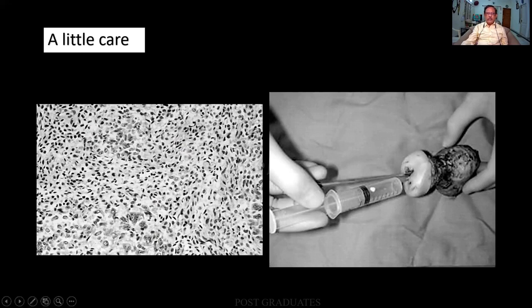And look at the effect of the non-fixation. I find that the cells are all going apart and the stroma is giving way. I do not know whether it is a degeneration in the menstrual phase or an autolytic degeneration on its own.